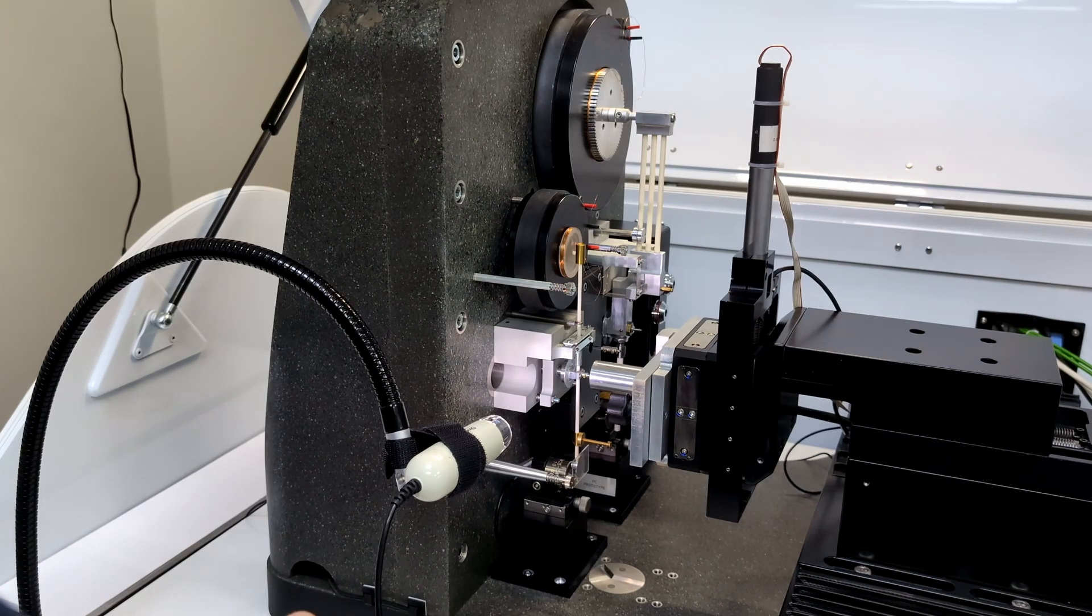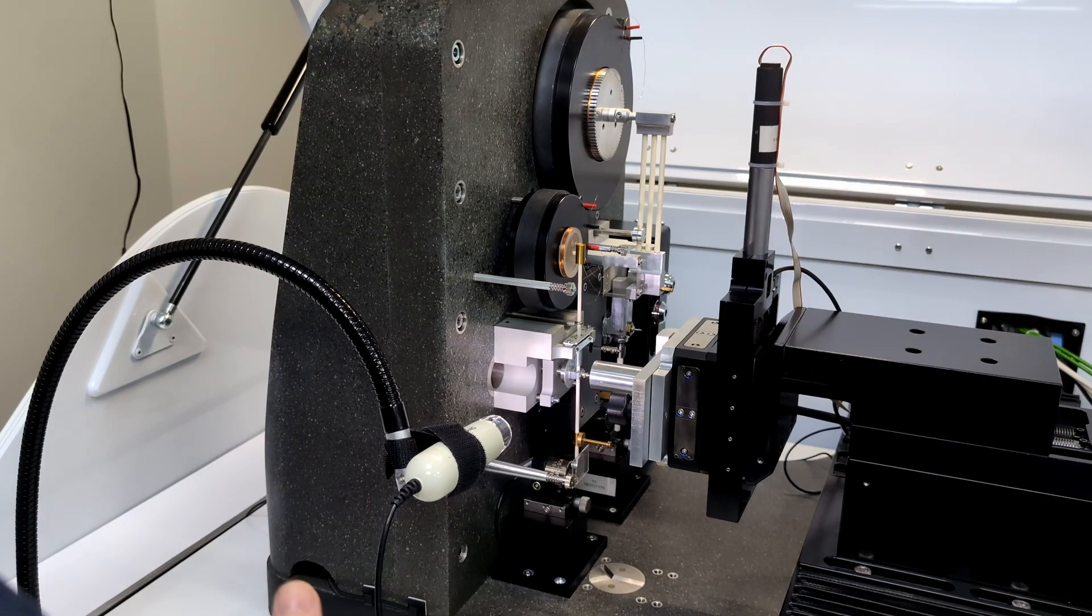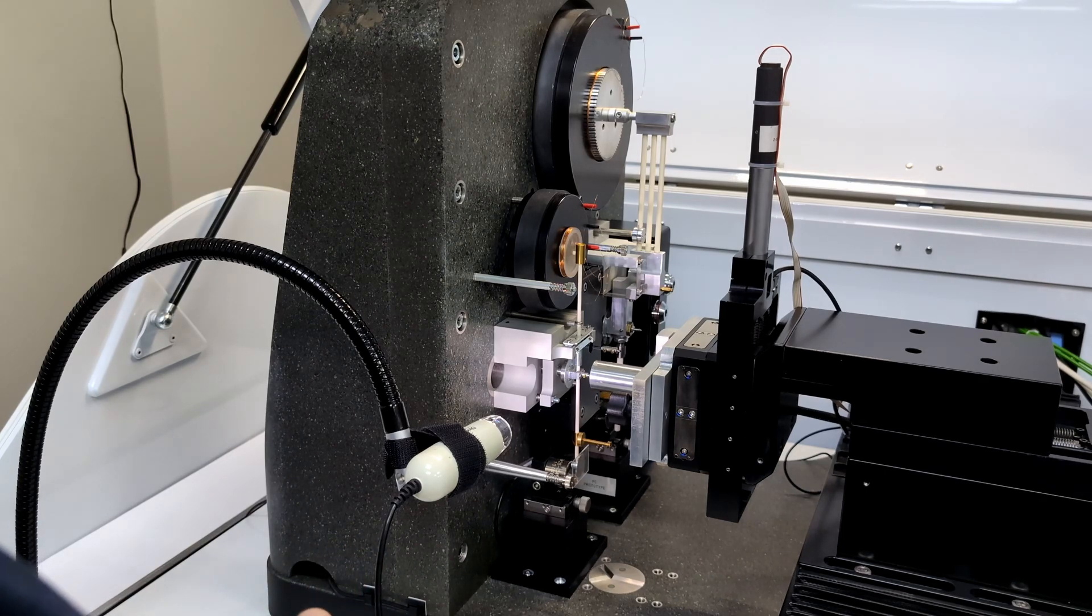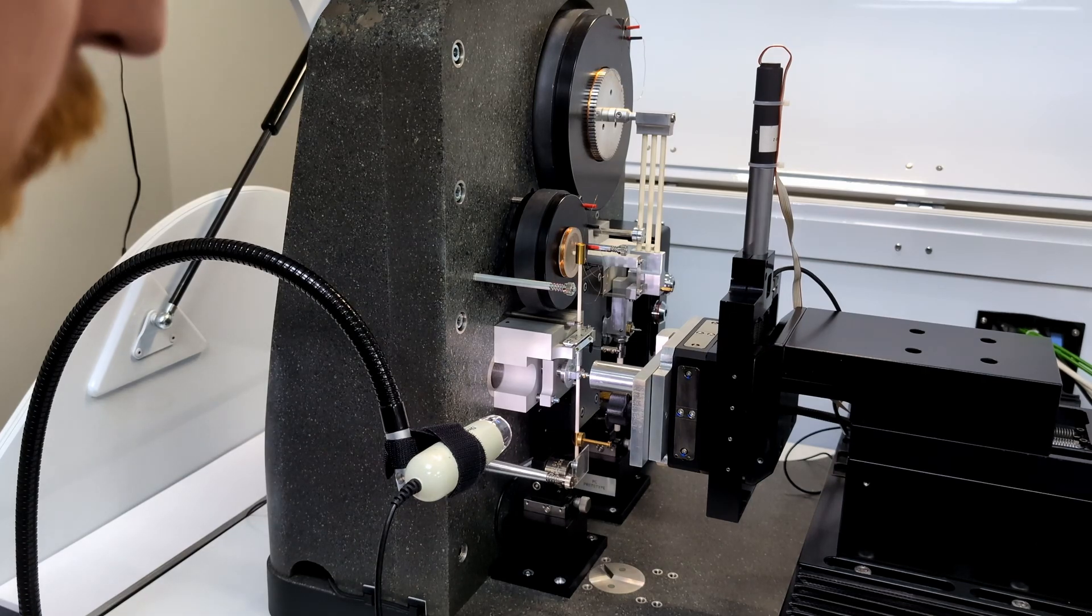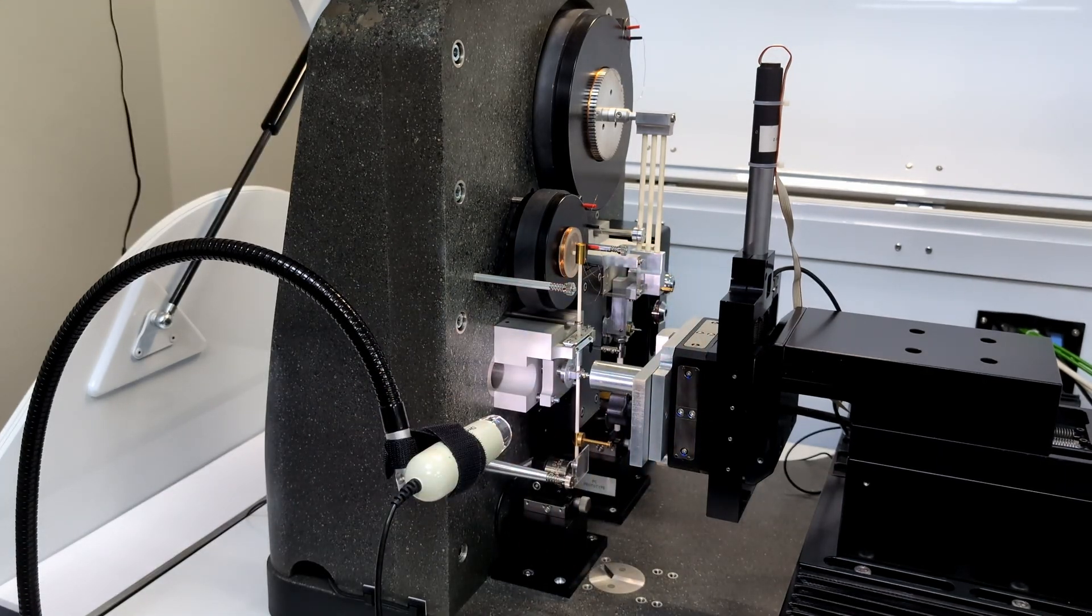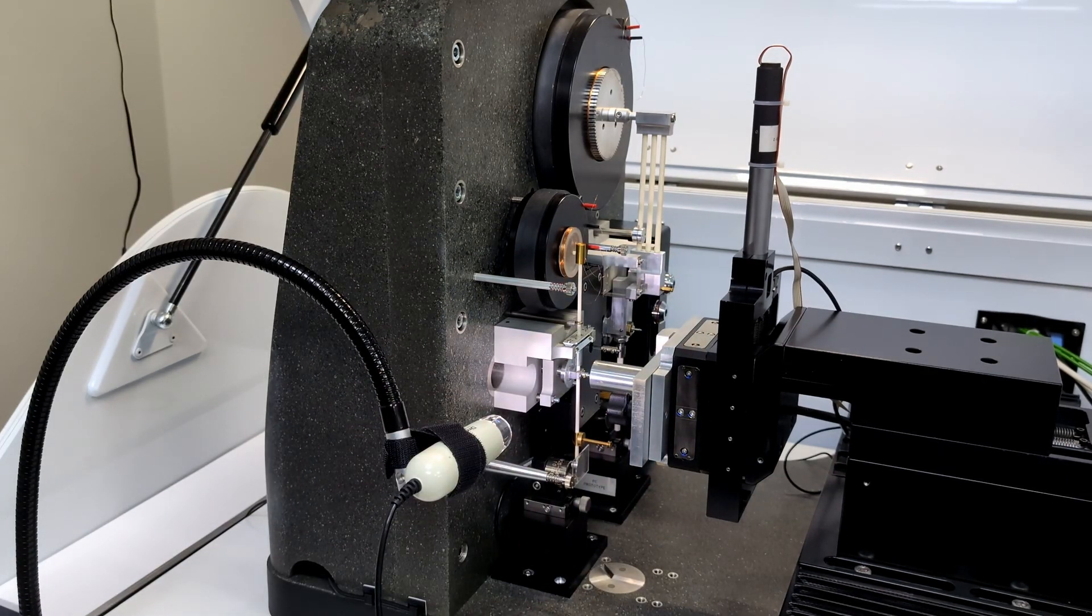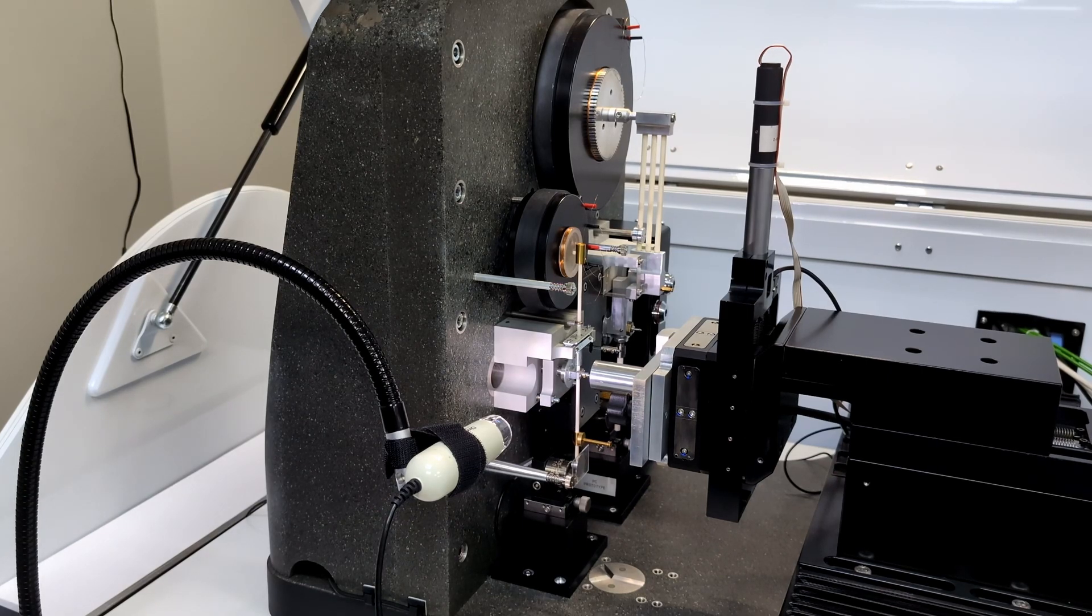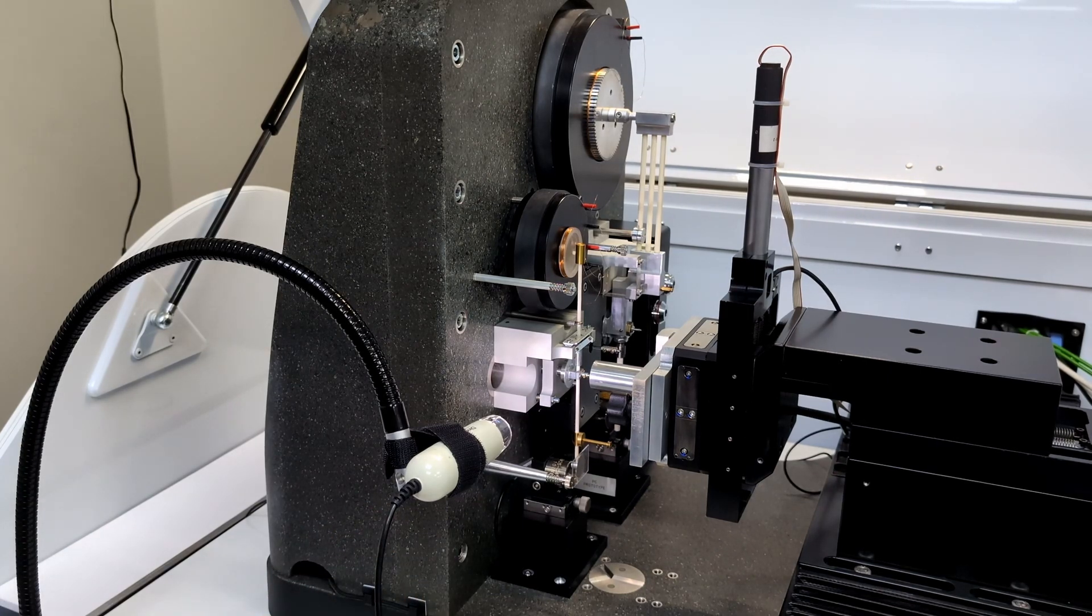This high-energy density accelerated fatigue test is capable of fracturing all types of hard, wear-resistant coatings, up to around 5 microns in thickness. The optical microscope, seen at the very rear of the system, can be used to look at specific areas on the sample to test, with a repositioning accuracy of better than 0.5 microns.